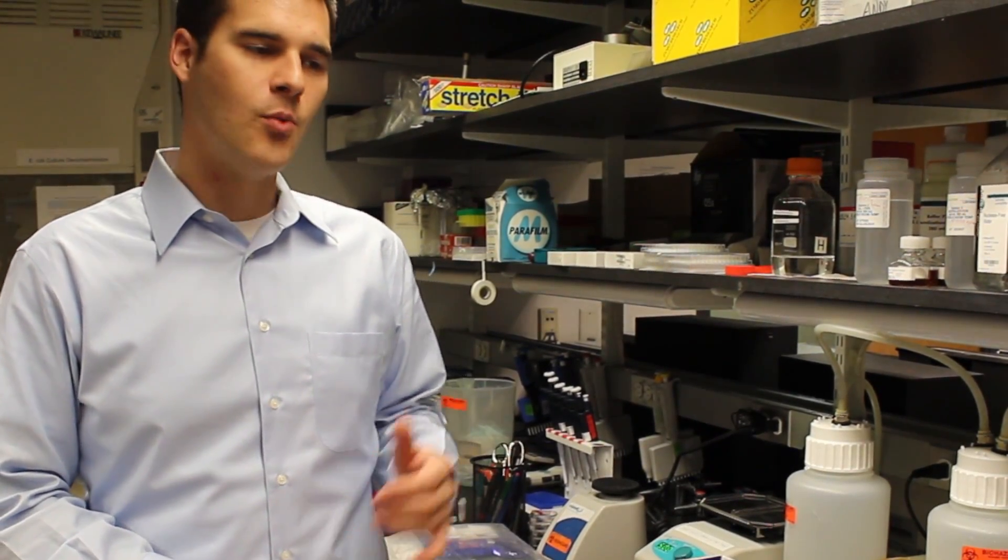Biomatrica tubes are a proprietary technology that allows us to keep some of our samples at room temperature without them degrading. The ones that we use in our lab are called clone stable. That allows us to put raw cultures directly into the tube and then dry down, and then when the recipient receives the product from us, they can directly elute DNA out of the tubes.